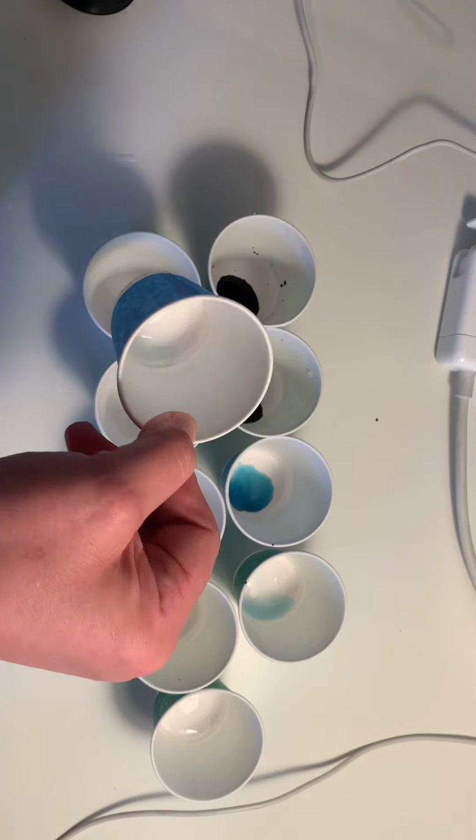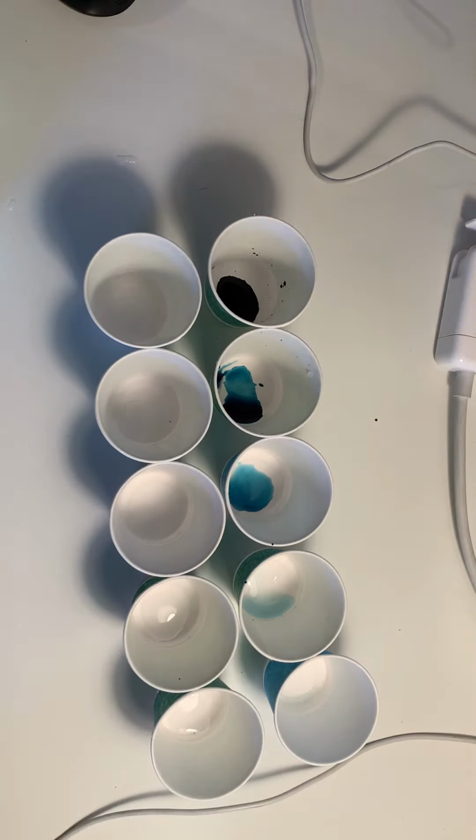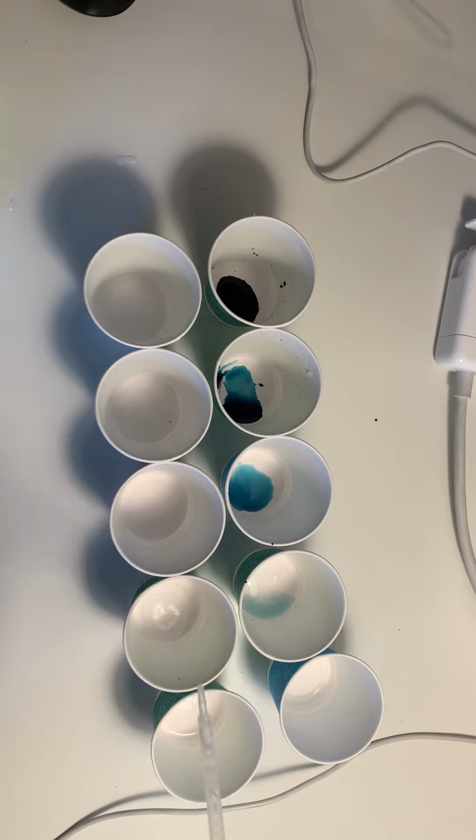I guess we could say it's still a blue color, but just very faintly blue. Now we're going to take a drop of that, put it in here, and I don't even see a color change there.